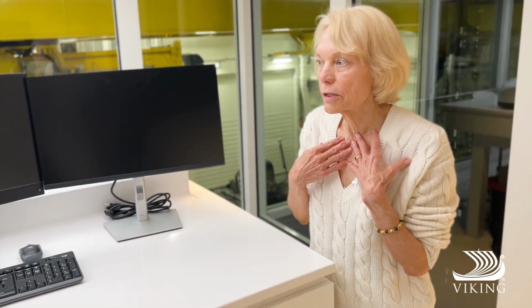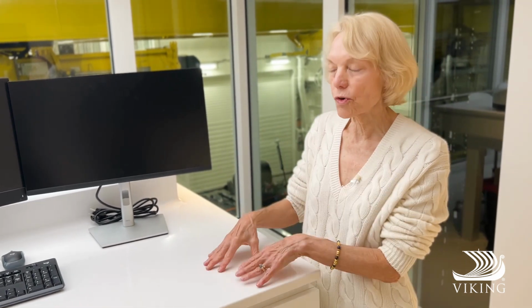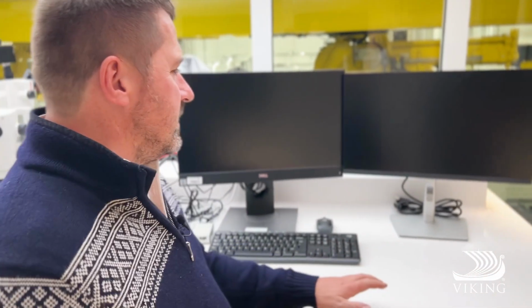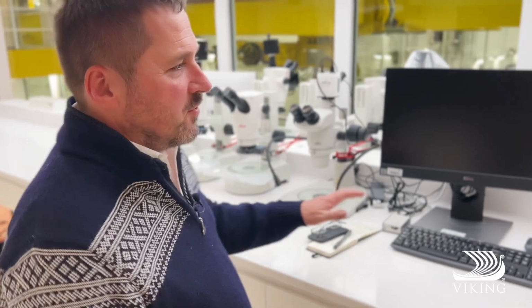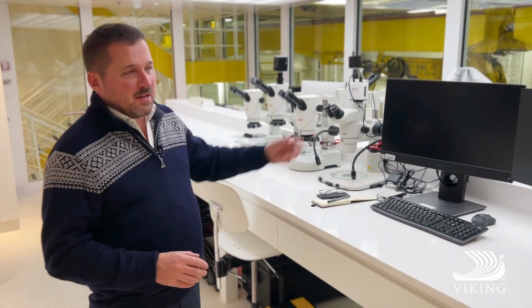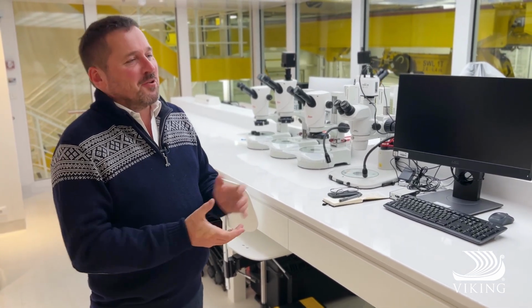Damon, I'm clearly a novice at this, and they describe this as a working lab in the literature. Could you show me a few of the key points of what that means? Absolutely. Thank you. So the key point about any lab space is having somewhere that you can get things wet and that you can spread out. If you don't have a lab on a vessel, you end up being on the back deck or in your cabin or in the galley or somewhere that everybody else on the vessel is not very happy about. Not optimal conditions.